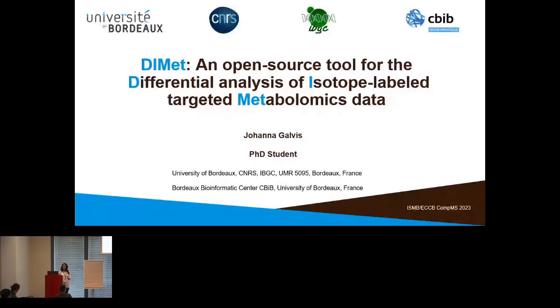And I am showing in this slide only a very small subset of the tools that are available to perform such analysis. I'm not going to go into details for each one of them this time, but just saying that none of them fulfill completely all the criteria that I have listed before. And that's why we have developed DIMet. But instead of showing all at once how our tool works, I will illustrate how we can use its functionalities in a biological use case.